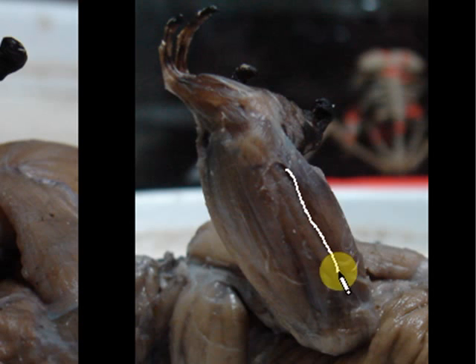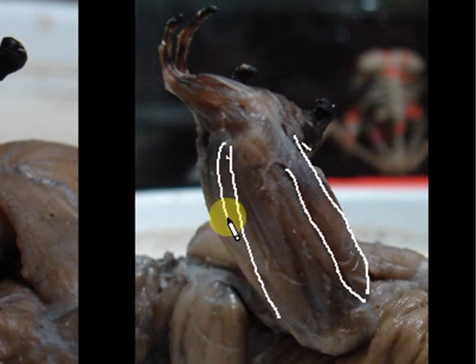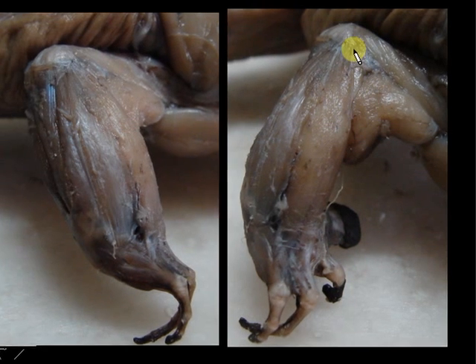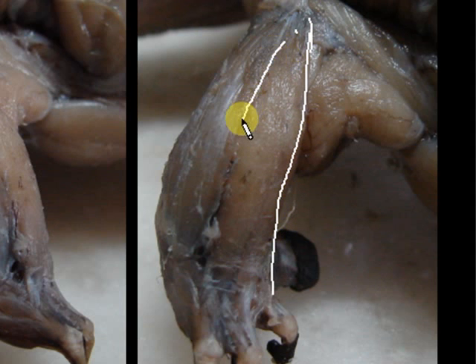From this somewhat lateral view, you will also partially see the extensor carpi ulnaris, which is somewhere here. Let's look for a better view. The bigger muscle here that connects to the digits of your hand is the extensor digitorum communis — that's how you know, extensor digitorum, so it extends all the way to the digits.